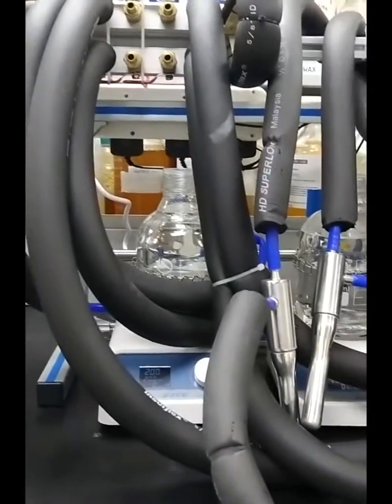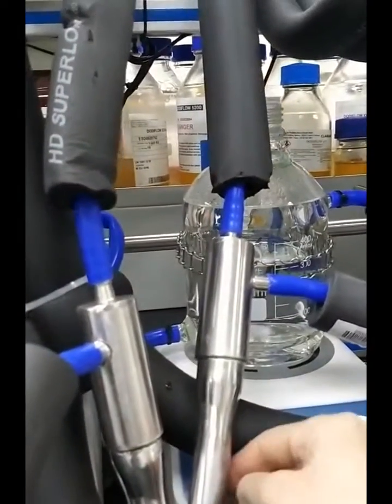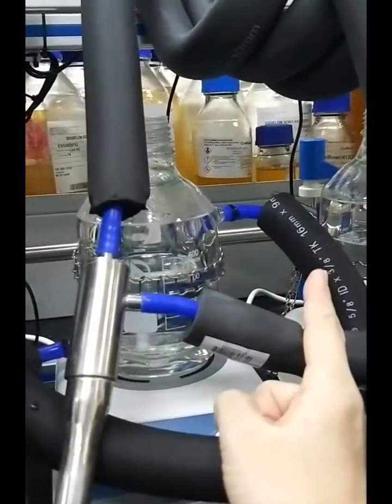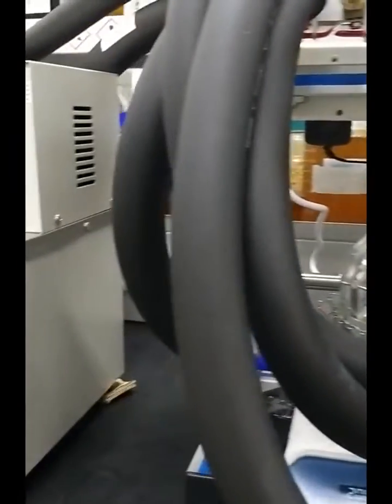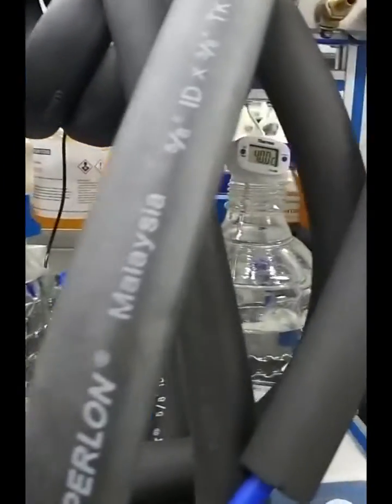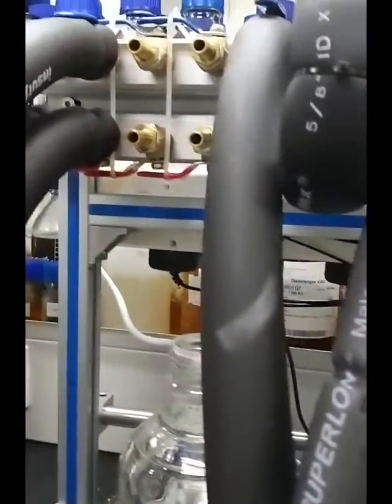The reactor was designed as a jacket reactor. Hot water can be inlet from the bottom and exit from the top. The temperature from the hot water bath will provide the same temperature to each reactor through the water distribution.